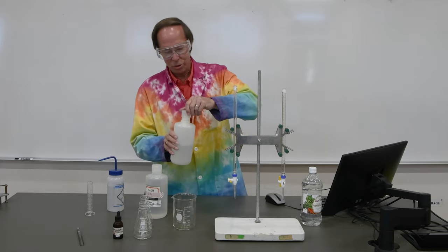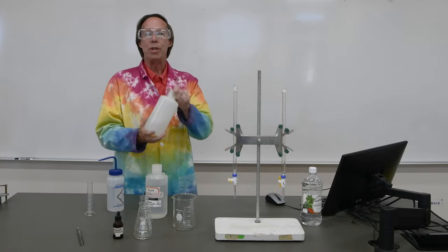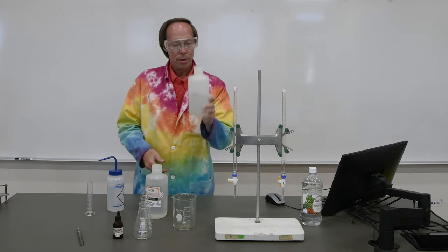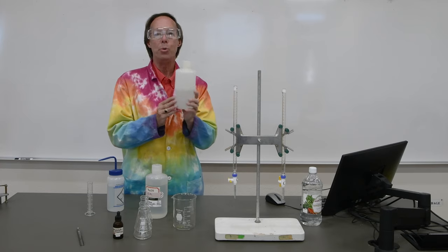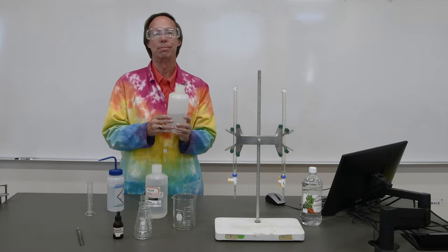So we'll take this diluted solution, make sure we mix it up very thoroughly. And then we can use this to standardize. So we will measure out a sample of KHP, and then we will do a titration with a couple of samples of the unknown sodium hydroxide solution to determine what its concentration actually is.